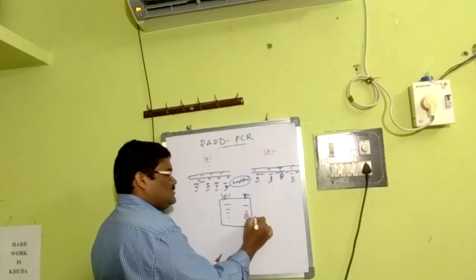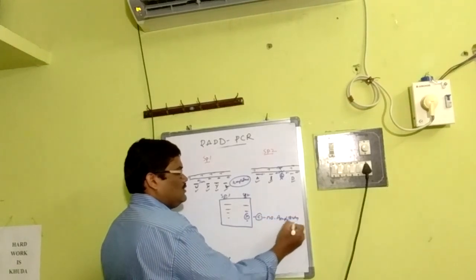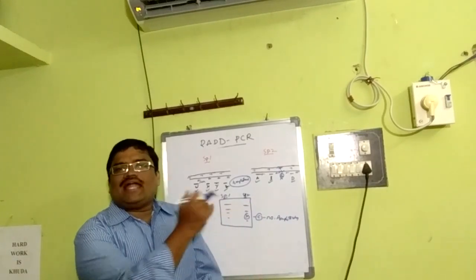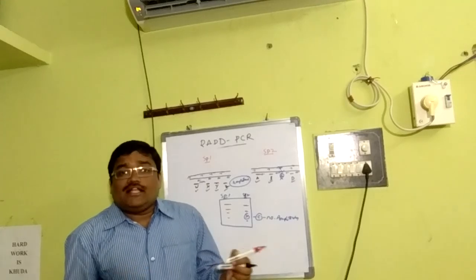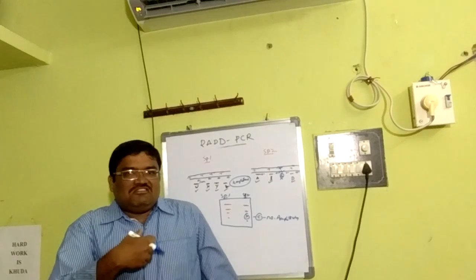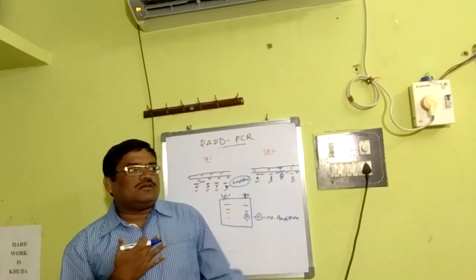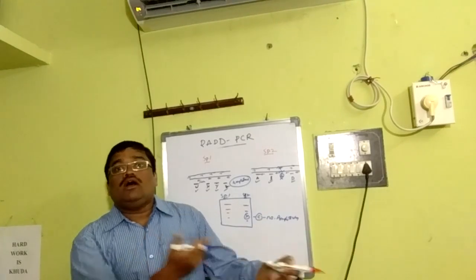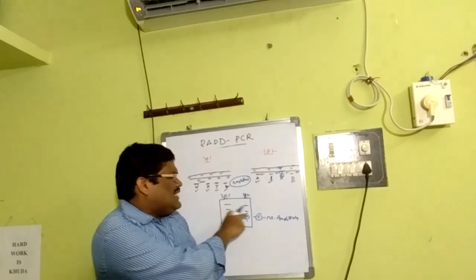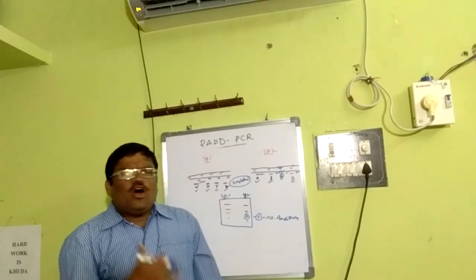Here, C is not amplified. That means no amplification. That means there is no similarity between these two DNA samples. Why is there no similarity? Because I told you already, within the species we have distinct DNA profiles or DNA fingerprints. My DNA profile is distinct. I mean there is no match with that of another individual. And how about the species? That means the dissimilarity is because of a variation. Variation may be because of mutation or polymorphisms.